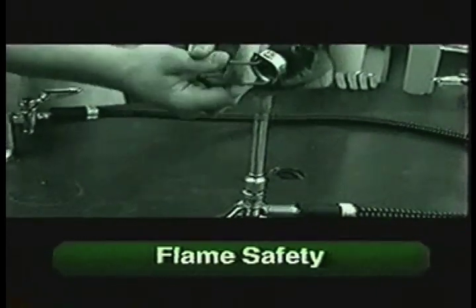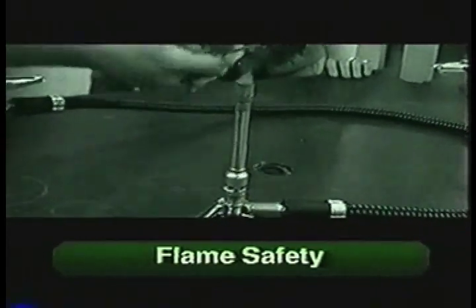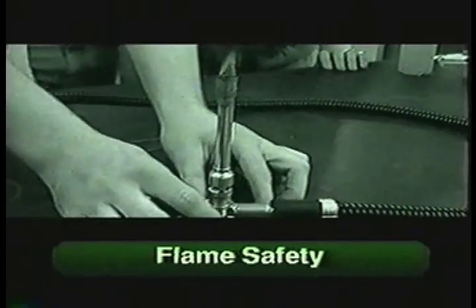Turn on the gas and light it away from you. When you've concluded your experiment, turn off the gas. Next, suppose a green parrot in a cage is part of your lab equipment. Your lab equipment includes a live animal. Treat the animal with care and respect. Its safety is important too.